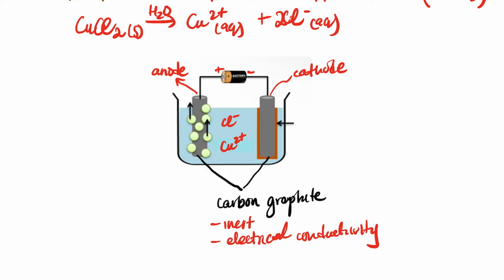Basically, the electrons are transferred from the anode to the cathode there. So as this one transfers the electrons, it will become positive, positive, positive. Forget about these bubbles for now. Let's pretend that they are not there. Even this reddish brown color is not there in the meantime.